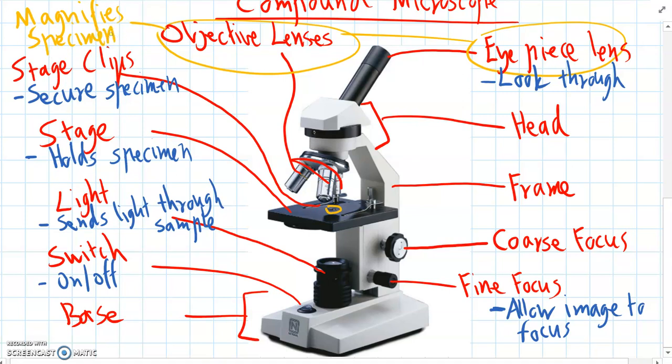So these are all the important parts of the microscope. And we'll get a lot more familiar with them when we first start to practice with microscopes.